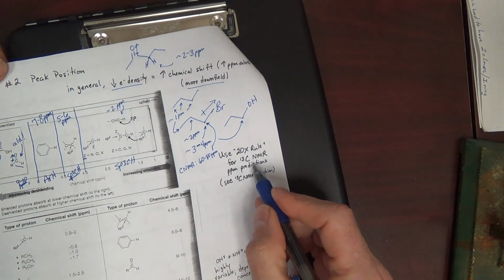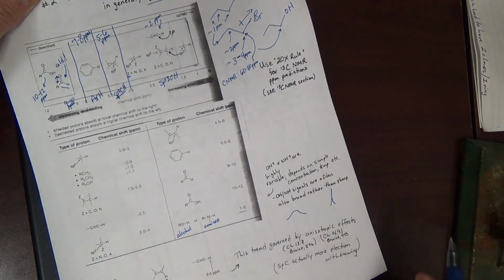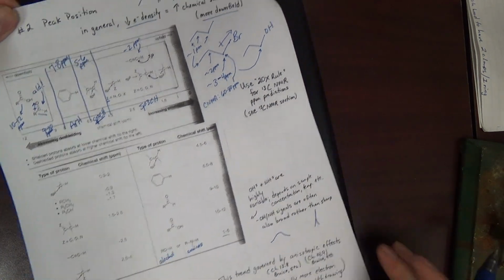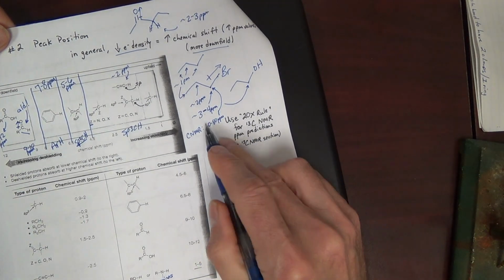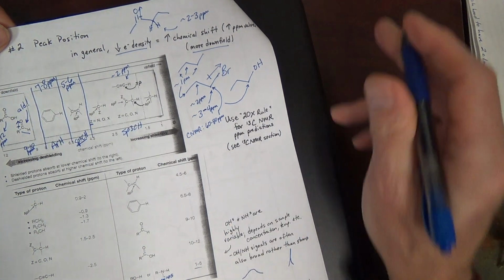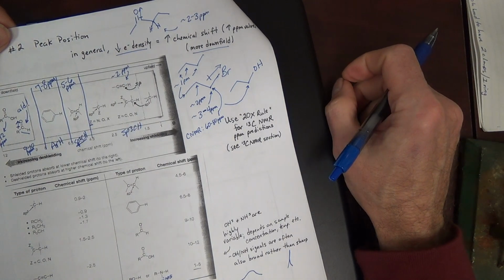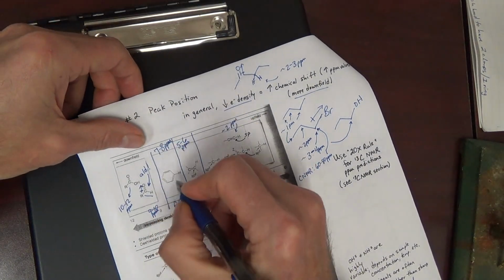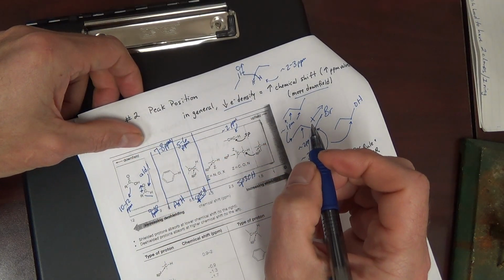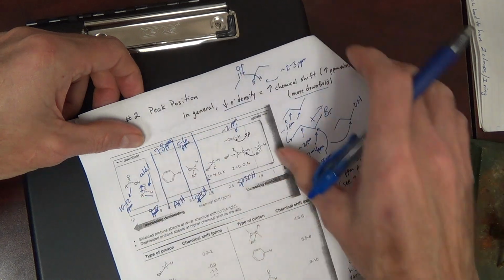When we get over to the carbon NMR section, we'll also see tables and look at that closer. So this is just a prelude to that. It's actually more like about the 18x rule, but usually it's just stated generically as 20x. Not that precise, but it does get you in the ballpark. As another example, aromatics. Again, don't write so much on your handout.